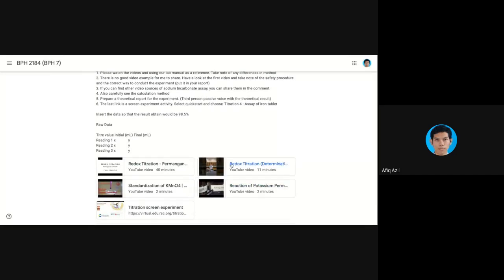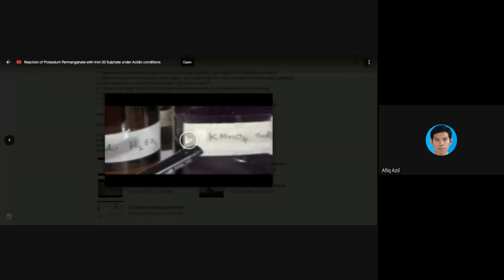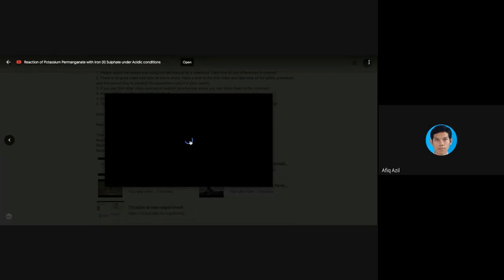I hope you watch the first video later, but I'm going to show you this one, the reaction of potassium permanganate under the acidic condition, just to show you the reaction itself.